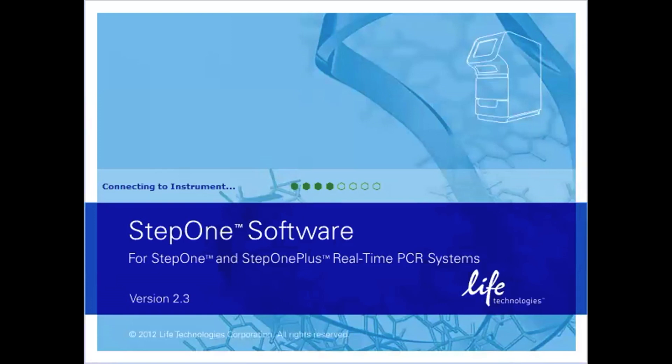Hello, the purpose of this video is to show you how to set up the QPCR software on a StepOnePlus instrument for QPCR analysis of soil-transmitted helminths in stool extracts.